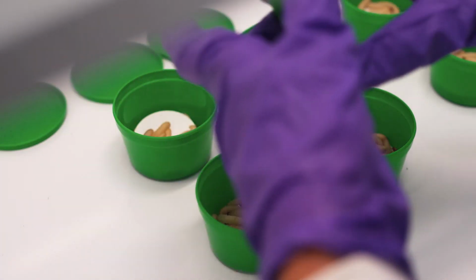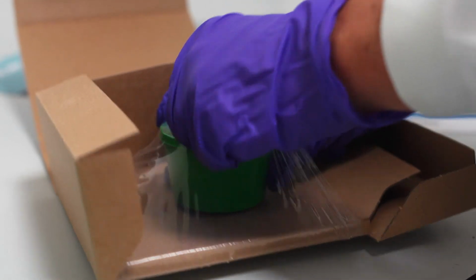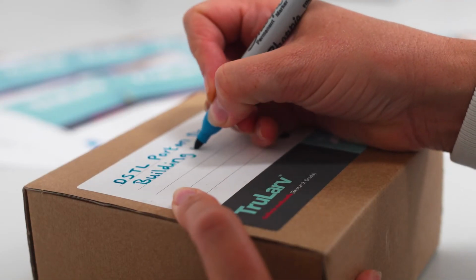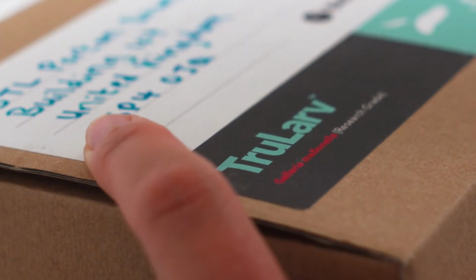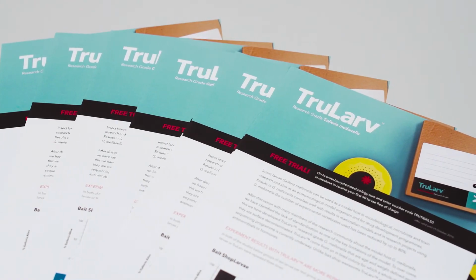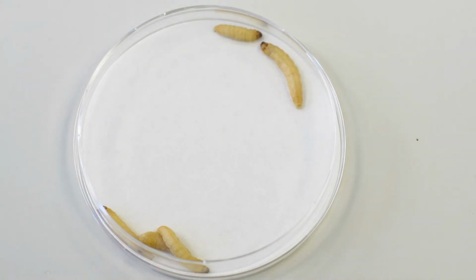We see that there are 3 main applications. One is in infectious disease research. One is as a model for drug screening, and in particular screening antimicrobial drugs. And finally, what we've seen more recently is to screen chemicals for toxicity. It enables people to do those studies much more cheaply, much more effectively, and to use much larger groups to give much more statistical power to those studies.